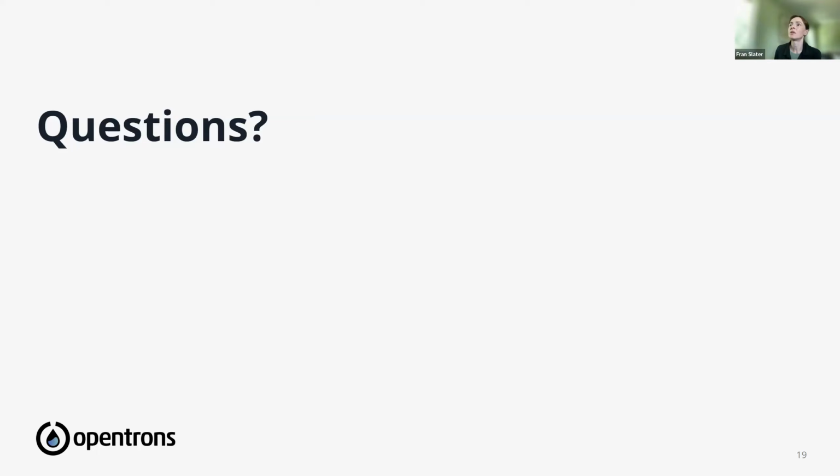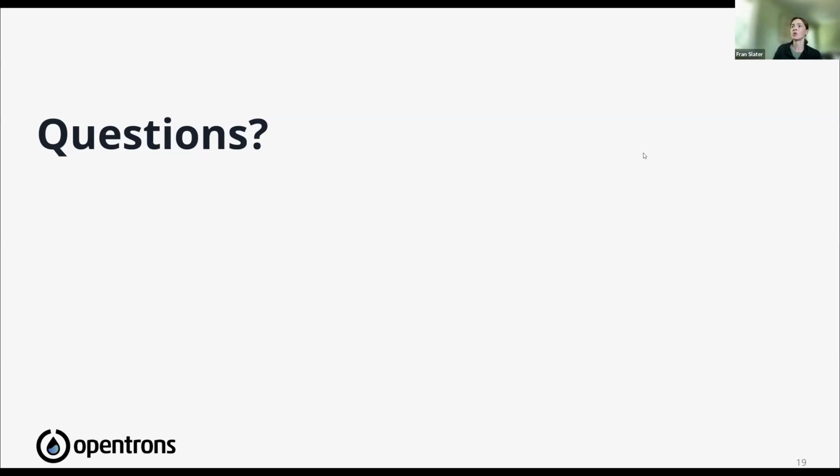Hassan wanted to share that they've made a website to make Opentrons protocols using a context-trained model at molbio.ai. Very cool.